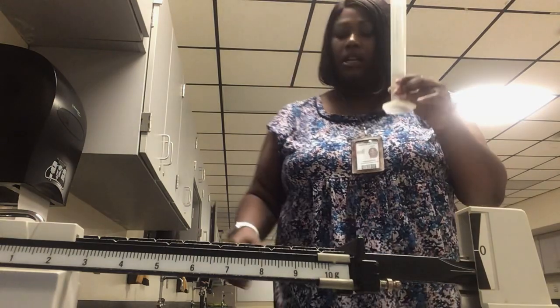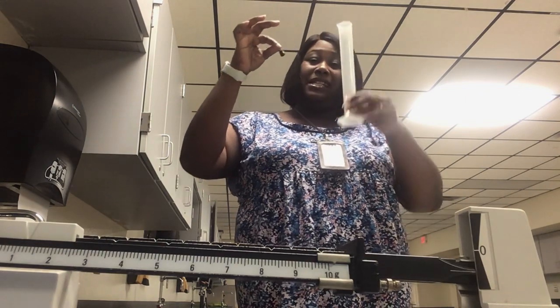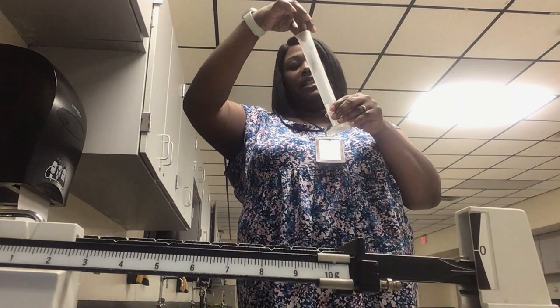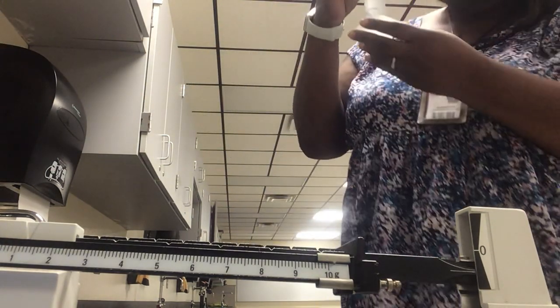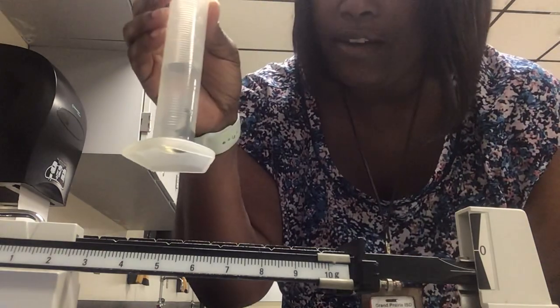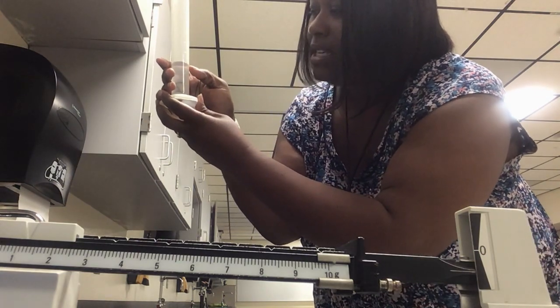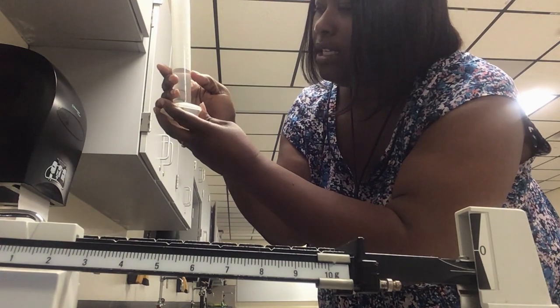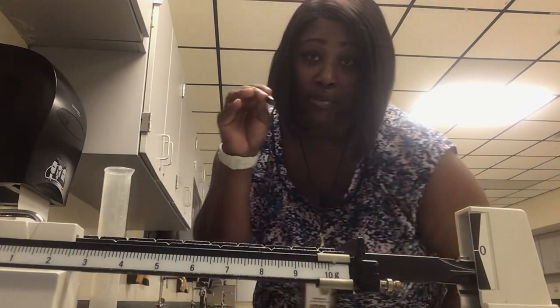So now, in order to find my volume, I am going to drop this irregular shaped item inside of this graduated cylinder like so. So if you don't want a big plop, kind of lean it to the side. So if you notice, initially I had 30. Now, when I put my irregular shaped item in, I now have 32. So that means the volume of this item will be 2 milliliters.